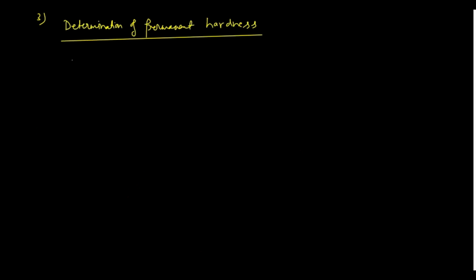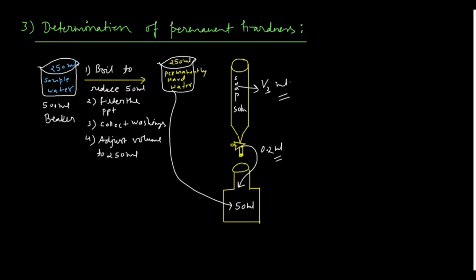What I have done here is I have taken 50 ml of boiled water, and this 50 ml of boiled water has consumed V3 ml of the soap solution.